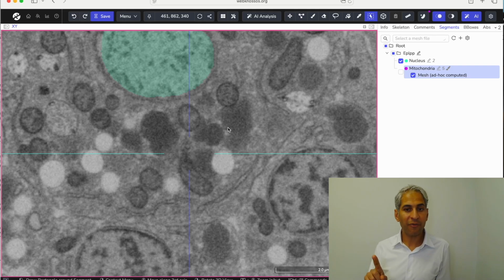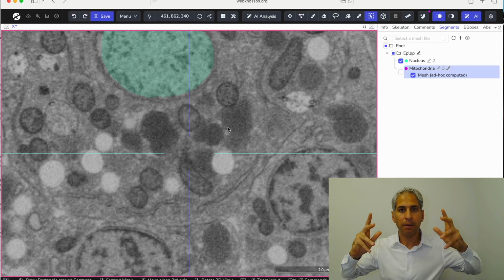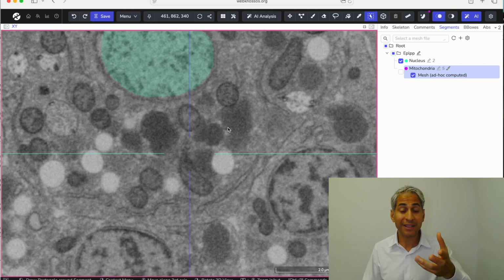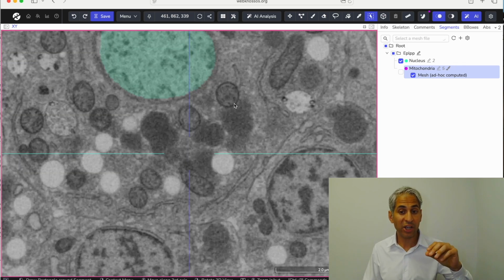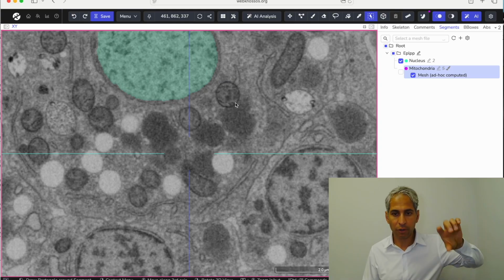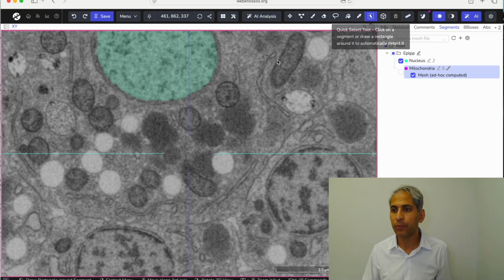I didn't start off by saying this is a spherical mitochondrion. I calibrated my expectations to an organelle I was as confident as I can be is a mitochondria. Then I took that confidence and applied it to an organelle with a variation. Here, the variation is that it's spherical. It's not a branched, looping, noodling tube. So I'm going to say this is a mitochondria too. In fact, it's going to give me an easy time because it's a sphere.